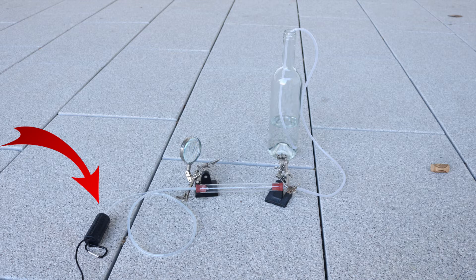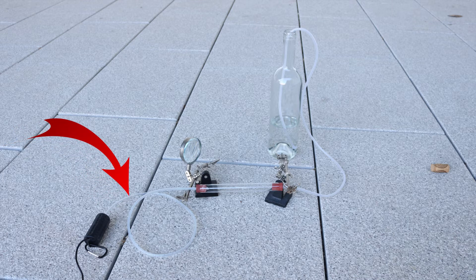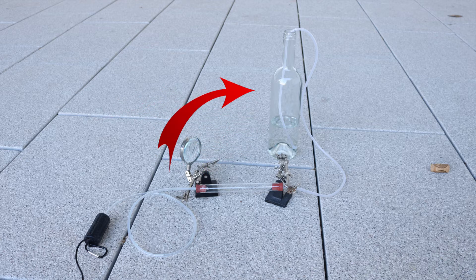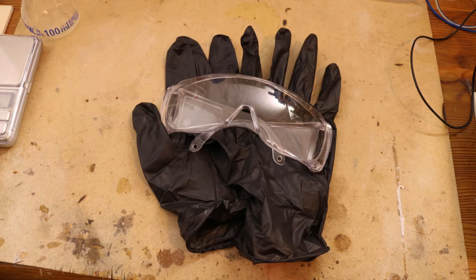Connected together it looks like this. The aquarium pump pushes air through the tube. The sulfur burns and on the other side you get sulfur dioxide, which goes into the bottle and dissolves into the water. While doing this you have to wear gloves and safety glasses — sulfur can be irritating, and the acid, well, it's acid.